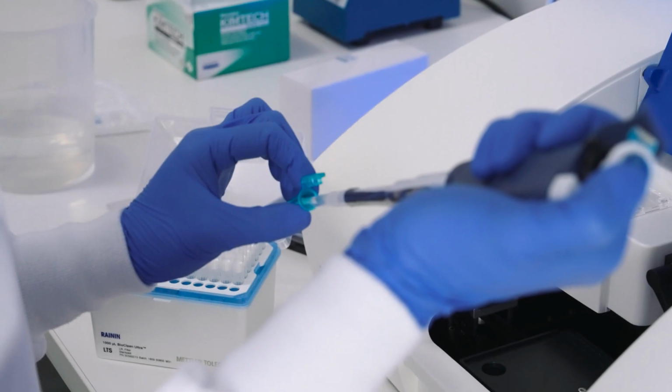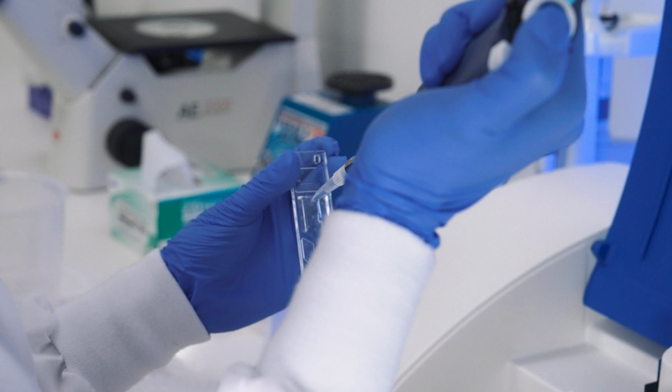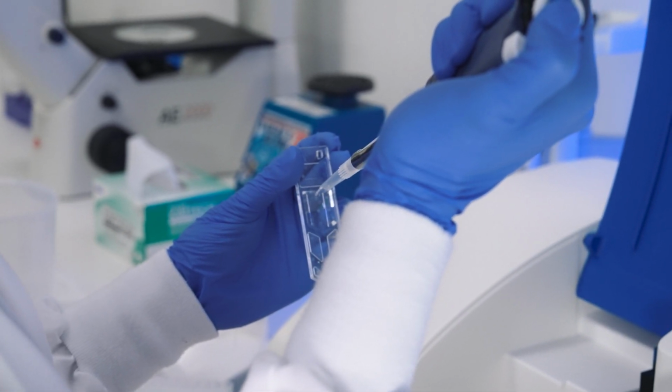We will be dispensing CHO cells, a common cell line used in biologics manufacturing. Our samples are a mixture of wild-type and green fluorescent protein-expressing cells. We will also stain these cells with Cell Tracker Red to identify live cells in the population. We recommend using a viability dye to improve experimental success in single-cell outgrowth.